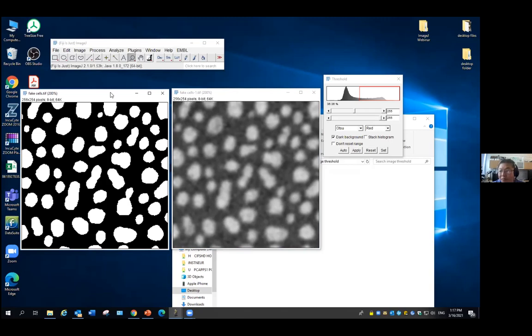Excuse me, Lai? Yeah. You have a question? Sure. You can unmute yourself and ask. Oh, I was just asking in the chat. I was asking if in the threshold menu, there's the Otsu. We will go through that later. Okay. That is the algorithm that helps you to decide. I see. Okay. Mine started as default. Should I change it to Otsu? That depends. We're actually just about to go through that. Yeah. Okay.